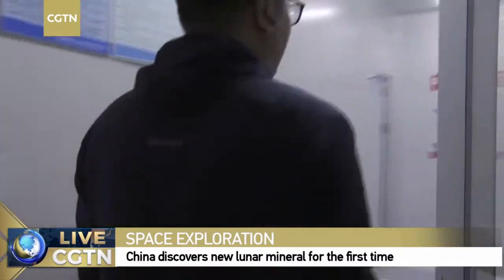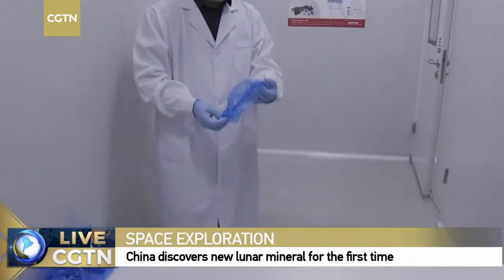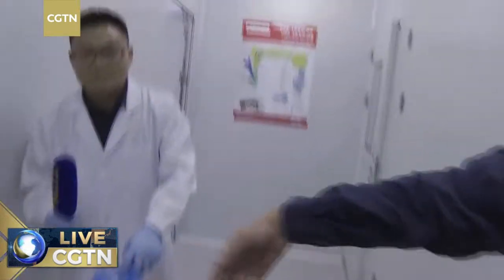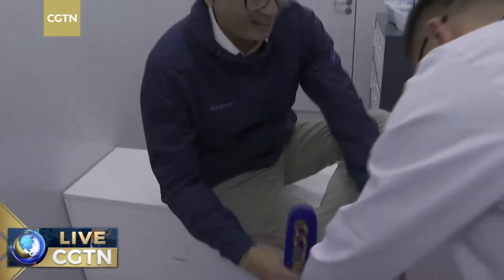Okay, so let's get inside. So first, when we get inside this laboratory, we have to wear the shoe cover. Let me help the video cameraman. Thank you so much. This is really important because when we go inside this laboratory, we have to keep clean, make sure our shoes are clean because this is a dust-free laboratory.